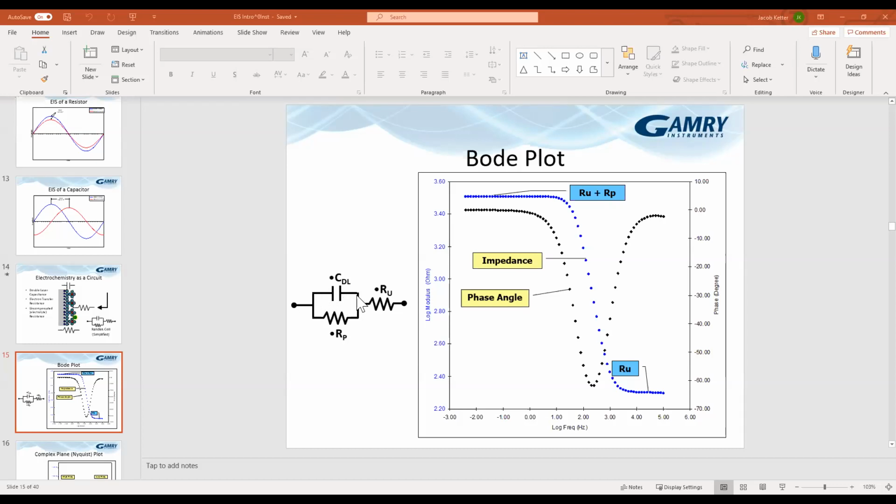So a few of them are going to pop across this double layer, or be used to align the double layer. But almost all the current is going through here. So even though this impedance is now very, very large, its effect is small. This is circuit theory: it's 1 over the impedance plus 1 over the impedance.